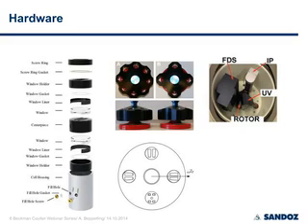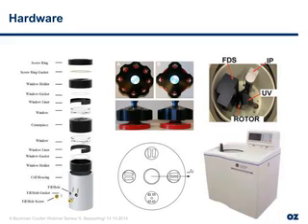You see here the three currently available commercial optical systems. The fluorescence system at the left corner, available from Aviv in cooperation with Beckman, the interference optics, and also the absorbance optics, UV absorbance optics, which is mainly used in experiments because, when we look at the next slide, this is the machine.